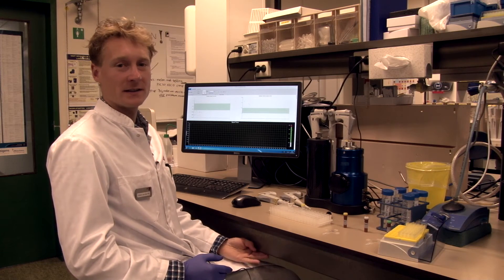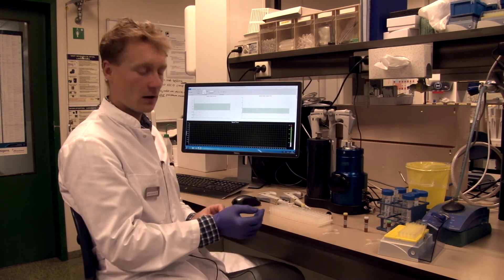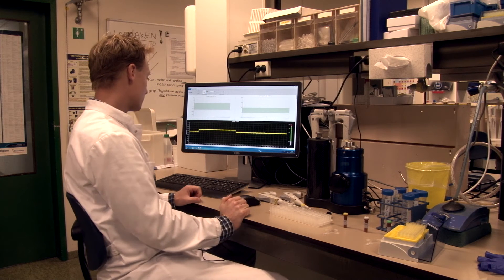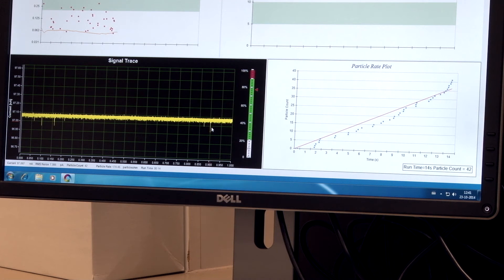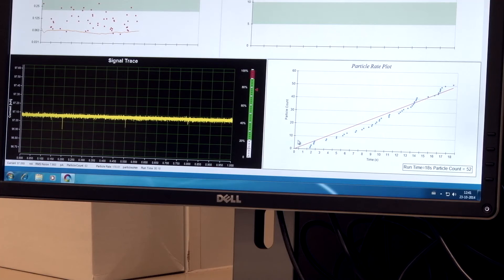I have replaced the synthetic reference material with our extracellular vesicle sample in the Qnano. Starting the measurement, we can see the baseline again. The first thing that is striking is that the troughs now have different sizes. That's because our extracellular vesicle sample is a polydisperse sample, so the sizes of the troughs are also different.